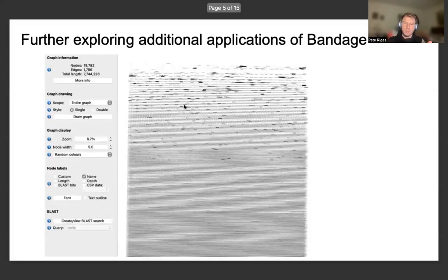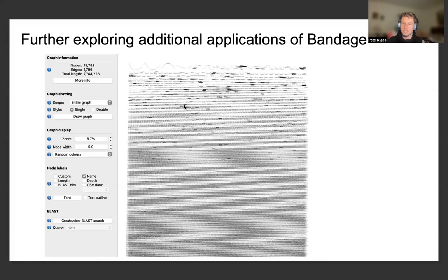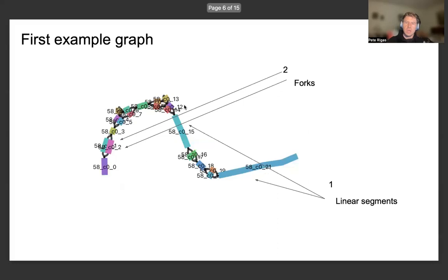So from the previous example, if we look at the total collection of graphs that Bandage constructs, we can look at different types of candidate graphs, meaning any one individual graph within the entire ensemble, and what the characteristics of this graph would be, and how this reflects qualities of the sequences that the Trinity transcriptome assembly procedure outputs. In this case, for the first item I've indicated, there are some graphs which have some components or pieces with linear segments. And in Bandage, there are settings that someone can use either within the GUI or in the command line to label each one of the segments of the graphs.